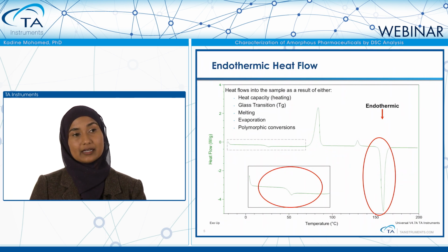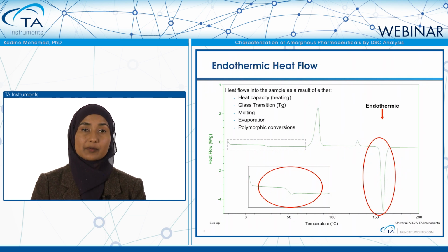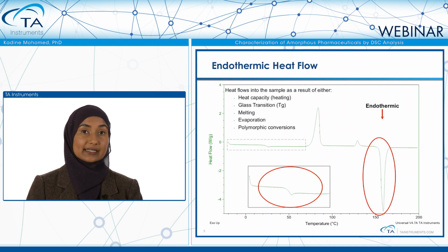This peak, in this particular case, is associated with the melt transition of the sample, although in pharmaceuticals, we can often see endothermic peaks associated with the decomposition of the material as well.